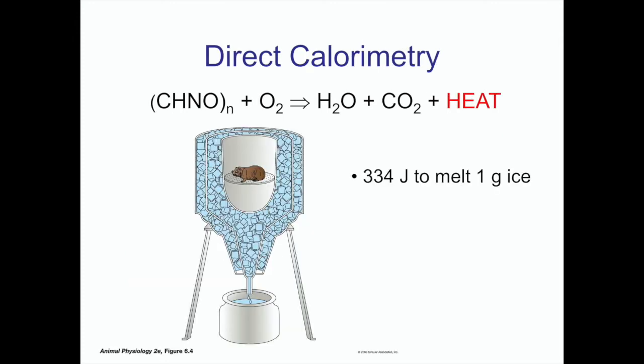The earliest energetics measurements were an attempt to measure metabolic heat. For this historical reason, measurement of energetics was called calorimetry, as the units of heat were calories. Metabolic rate can be determined by measuring total heat output. Since this is directly measuring heat production, this method is called direct calorimetry.